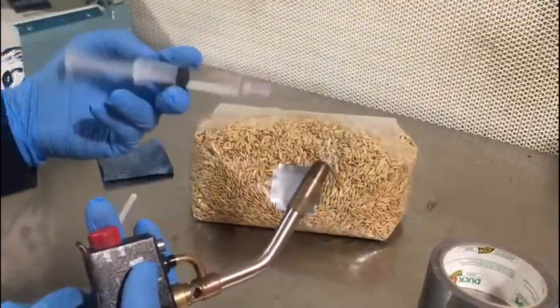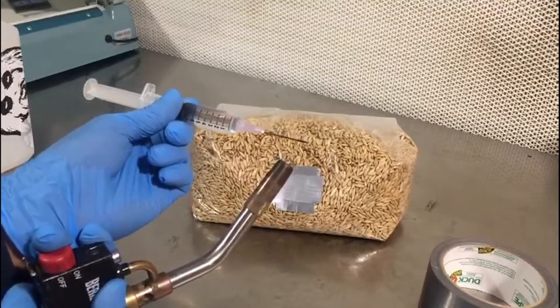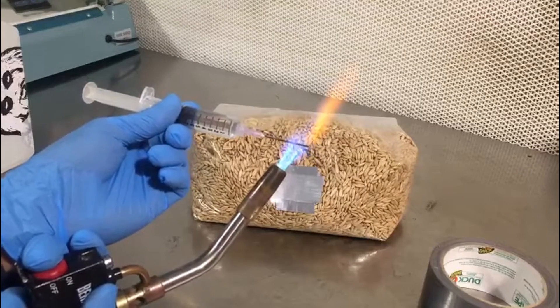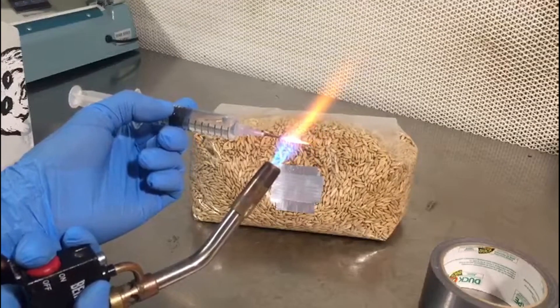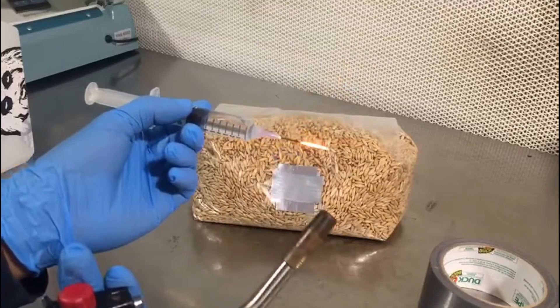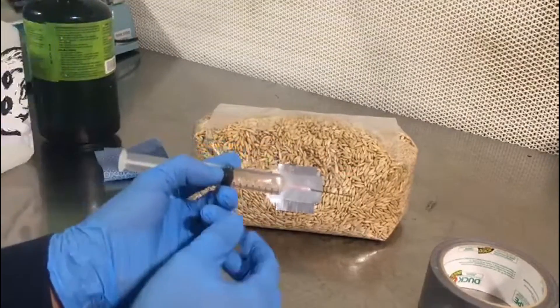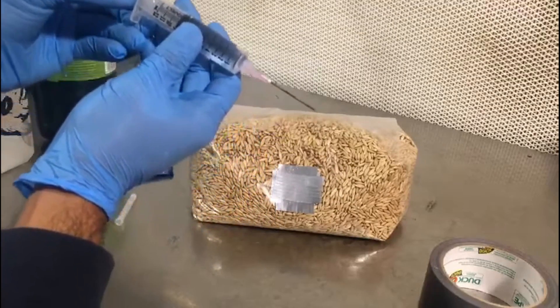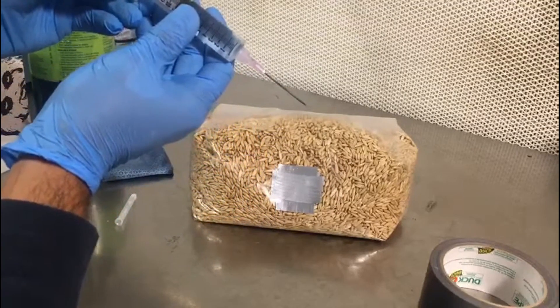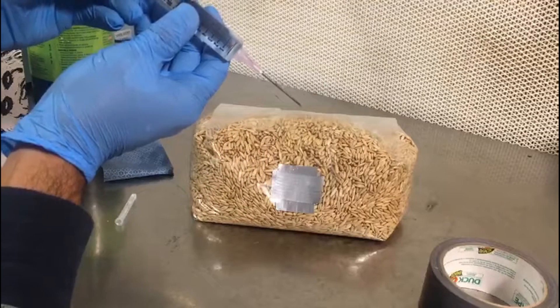To flame sterilize your needle, you will simply torch it or flame it until it is red hot. Once it's glowing for two to three seconds, we can take it away from the heat and we will cool the needle by injecting some fluid through the needle.